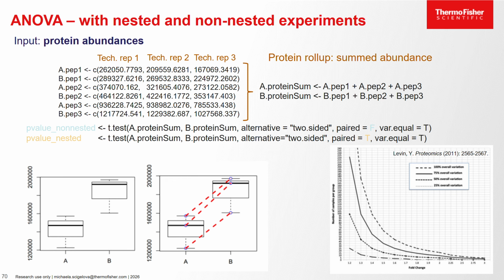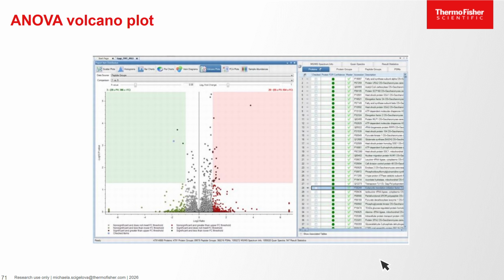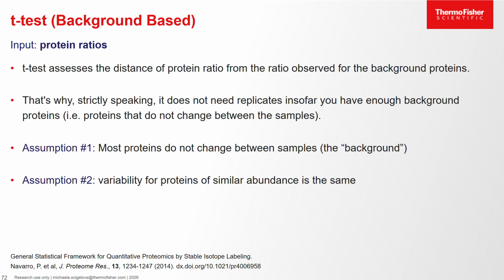So I would recommend to look at this small publication. It's just a couple of pages, and it might help you when you are setting up your experiment. At the bottom line, if you work with ANOVA, the number of replicas is very important, and we would recommend, based on our experience for proteomic experiments, at least 5 in each sample group. And this is not what everybody has.